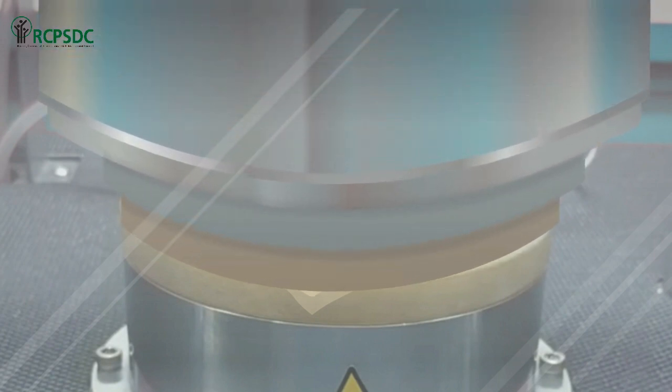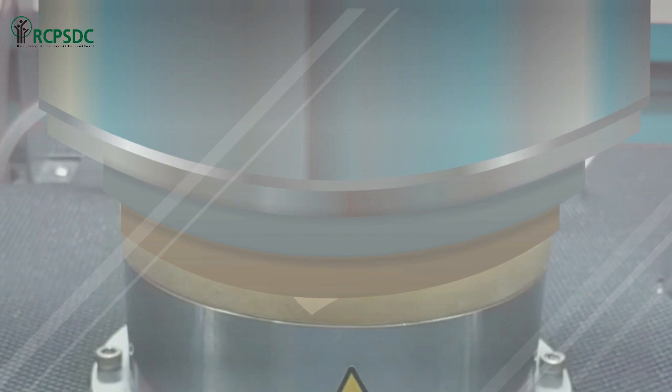The rheometer puts the rubber compound under positive pressure at a specific constant temperature, which depends on the type of compound and the cross-linking system used. As the cure rate of the compound in the cavity progresses, the stiffness of the specimen and therefore also the torque on the rotor increases.